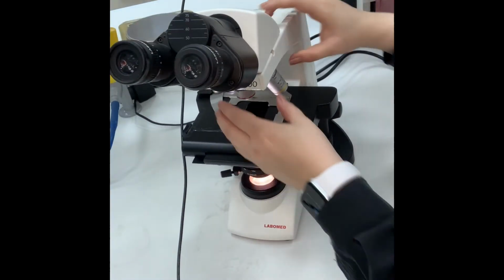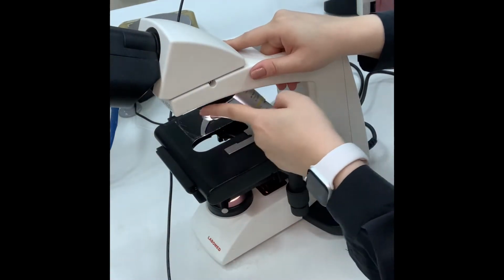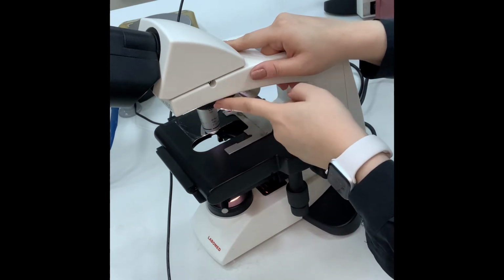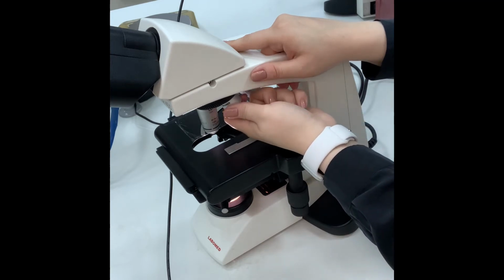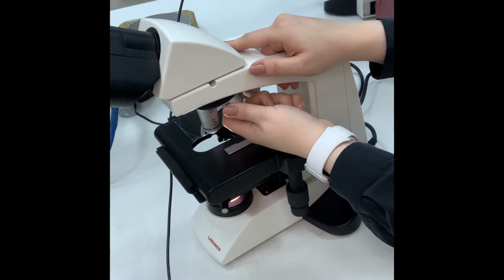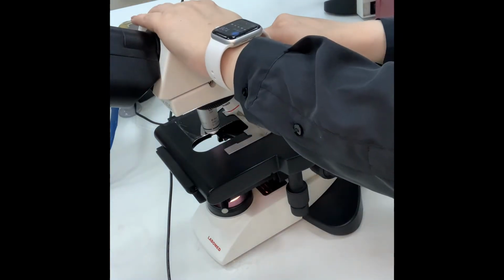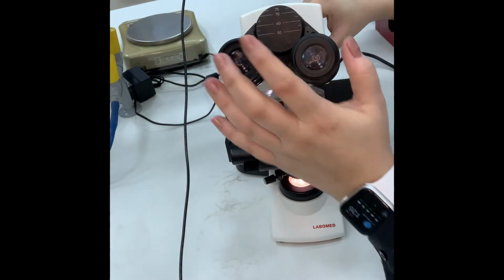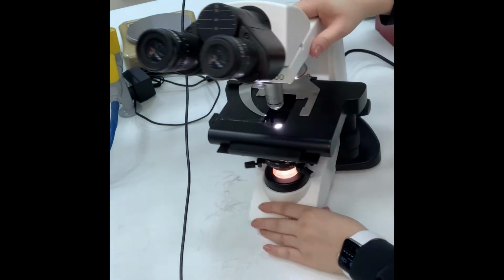And over here I have the black round part, you cannot see it. This is the revolving nose piece. It carries the objectives, and from the name it revolves in order to move from one zoom to another. These are the objective lenses, and they are magnifying lenses attached to the revolving nose piece. Now this is the head of the microscope that carries the oculars, and to define oculars, these are lenses that you look through.